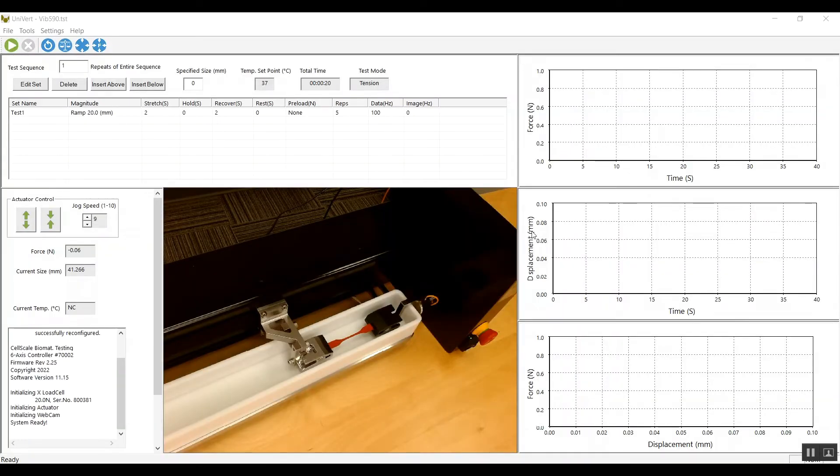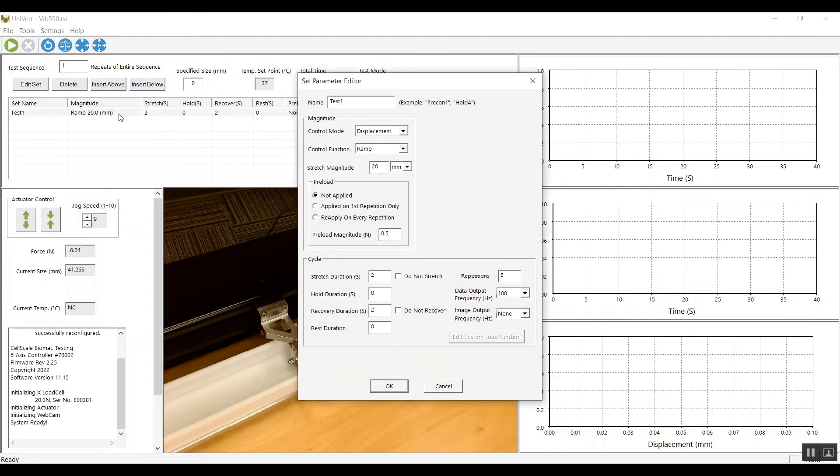I'm not going to do a full overview of the UniVert software in this video. It does many different things but for now I've just set up a simple tension test in a horizontal orientation. On the top here, I'll pull this open just to show you where I've specified my test protocols as a displacement controlled test with a ramp profile.